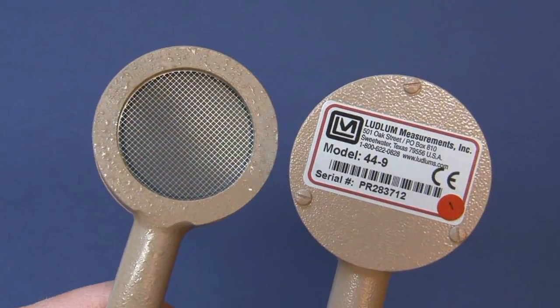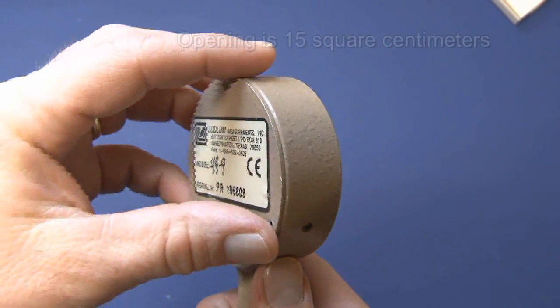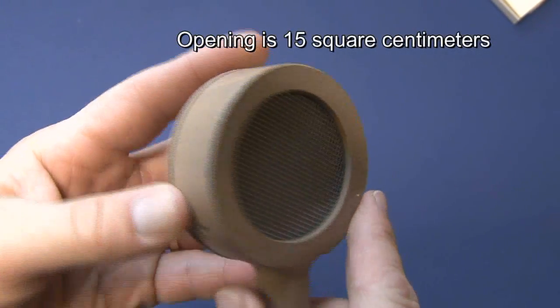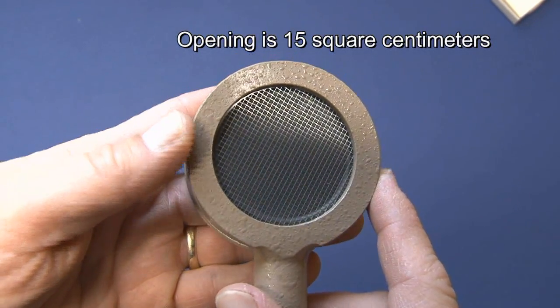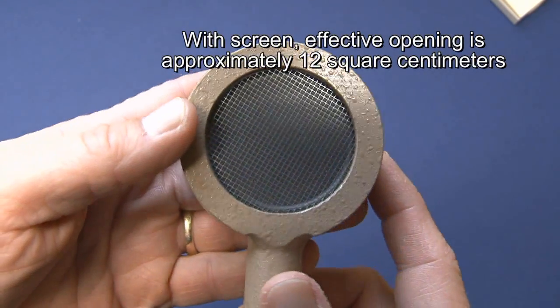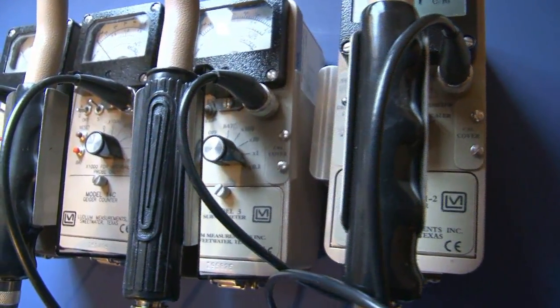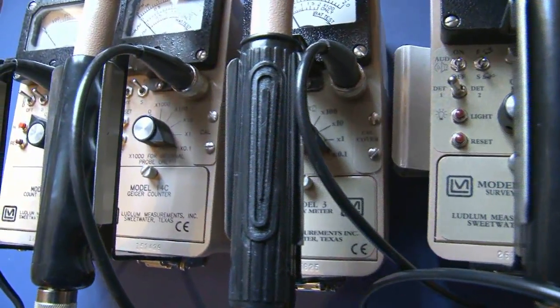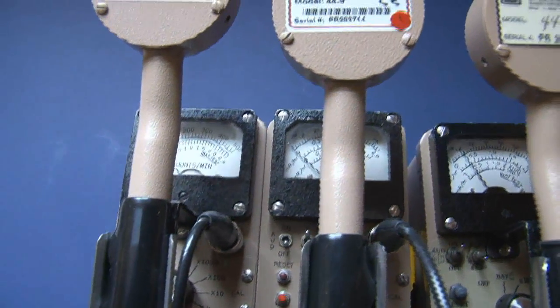If we look at the detector part of this, it's got an active window area of about 15 square centimeters, and you can see the little screen here that covers it. If you take into account the open area of this screen, it gives you about 12 square centimeters of open area. The detector can be connected to a pretty wide variety of different survey instruments — any of them that operate between 850 to about 1000 volts will work, with 900 volts being ideal for this type of detector.